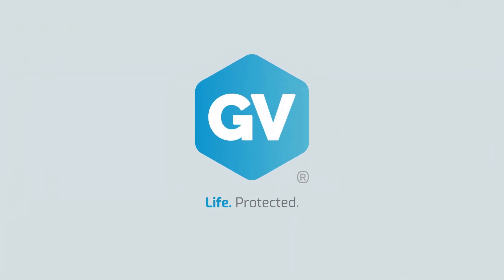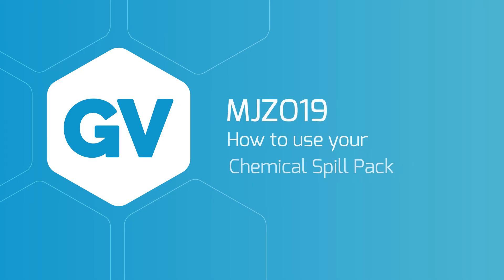GV. Life protected. How to use your chemical spill pack.